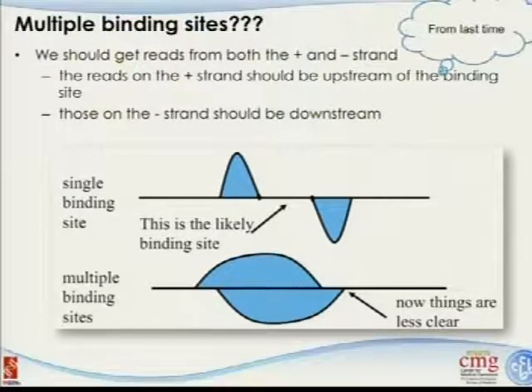And so once you do the analysis, you want to go back to the genome browser to take a further look at whether your strategy is reasonable or not. I haven't seen any established approach to tackle this problem, but it's very possible that before you discard this type of signals, you want to look for the motif, the sequence features within this region. If you see several things that are pretty similar and occur multiple times in this broader region, that is the indication that potentially there are more binding sites in this region.